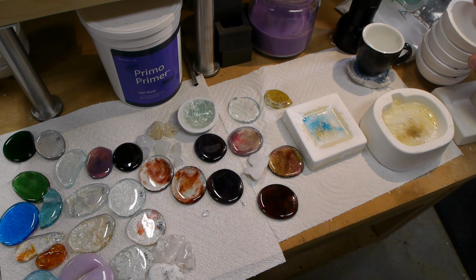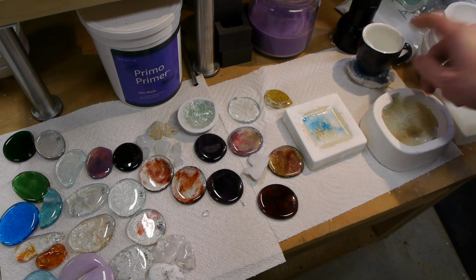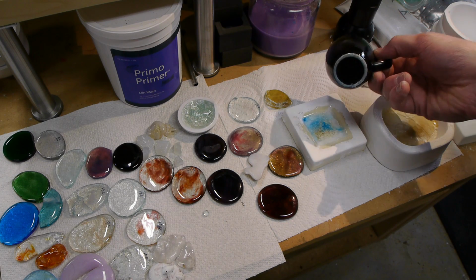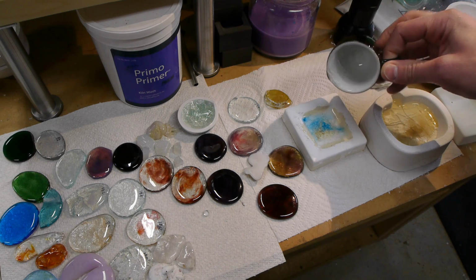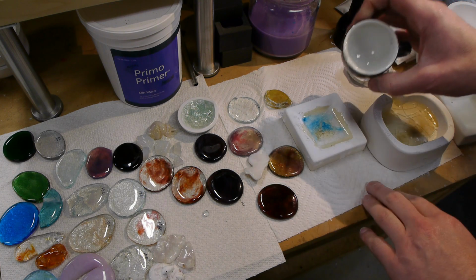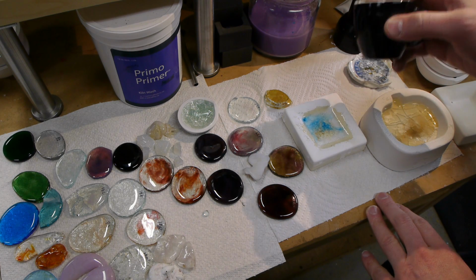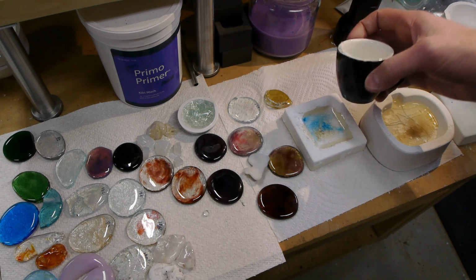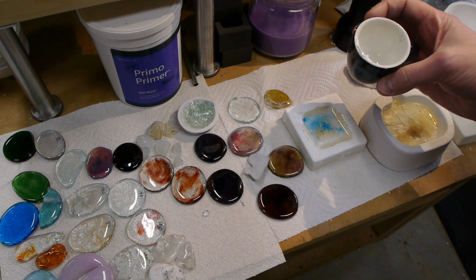If you're in a bind and you can't find or afford these alumina melting dishes, it's also possible to use porcelain. So if you go to the store and buy just plain old porcelain dishware, this can be okay. The temperature that this can sustain is just barely high enough to do some glass experiments. And we can talk about making the glass melt at low temperature so that you can use porcelain melting stuff.